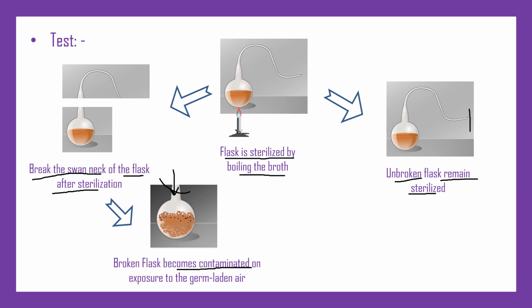So it gets contaminated because of the entry of air, whereas in the other case we prevented the air from coming inside this flask. So the organic molecules do not generate the microorganisms, but the entry of air leads to the entry of microorganisms.